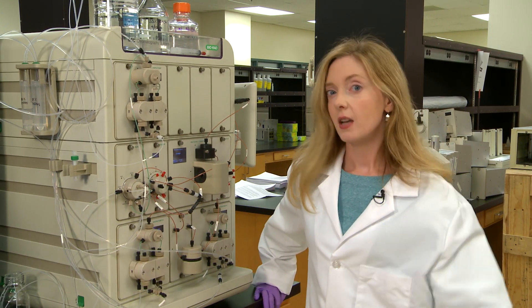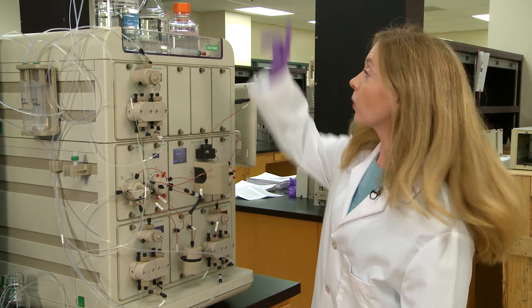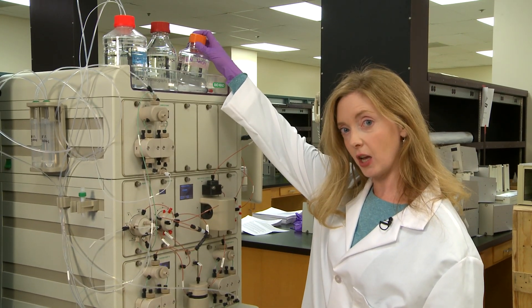Here are four great tips for keeping your chromatography system in tip-top shape. Tip number one: sample lines and sample loops should be regularly cleaned with one normal sodium hydroxide. But remember to use water or a neutralizing buffer afterwards.